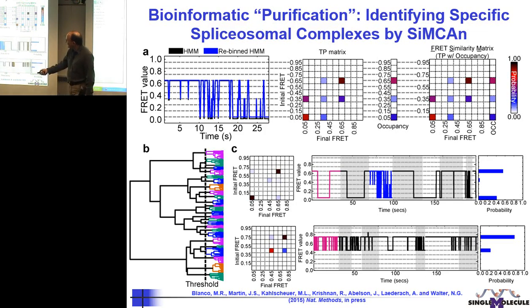And then we had in the end, I think, 17 different dynamic clusters, and 6 static clusters. That is molecules that had just one state throughout. Okay, but that came out from the cluster analysis. And of course, are you most interested in the clusters that are visited? Yeah. So they give us, but it's more complicated. It turned out that the most unique new observation was actually in one of the static clusters that had a certain position in the splicing cycle, where we visit this very low FRET state in a very stable state, and that had to do with a particular mutation. I'll briefly talk about this.